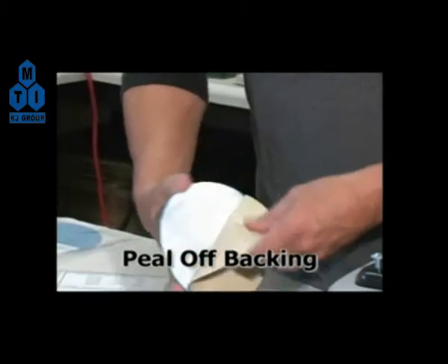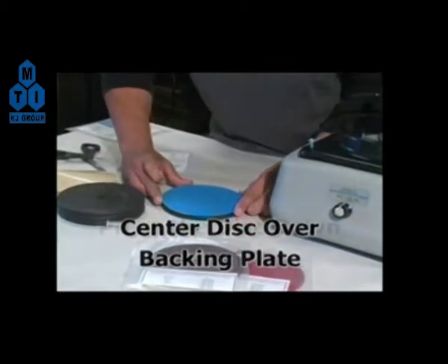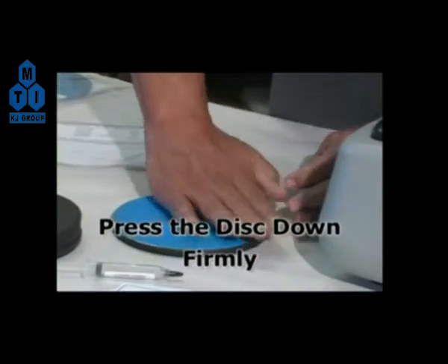Carefully peel the adhesive from the back of the disc. Center the disc over the backing plate and press the disc firmly onto the plate, making sure there are no air bubbles or creases.